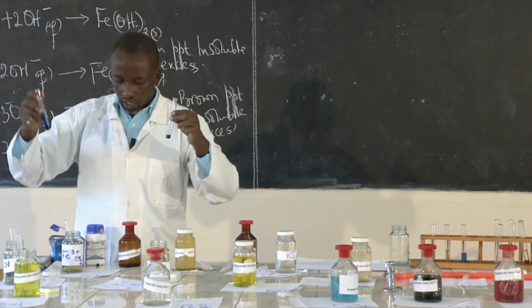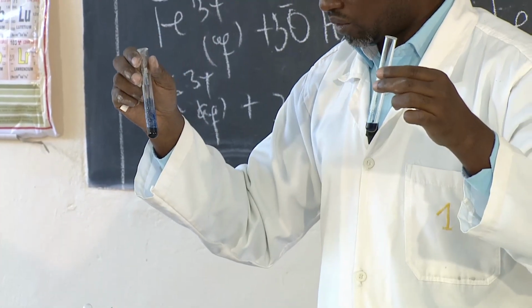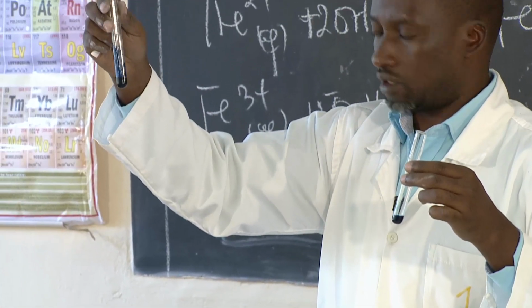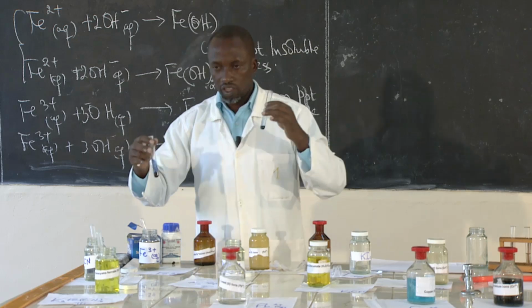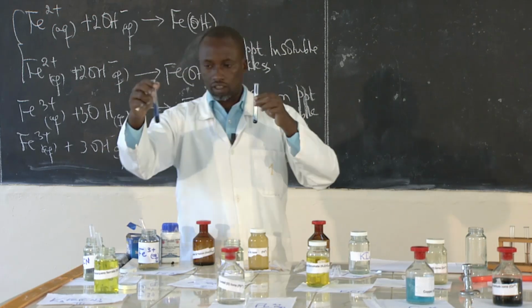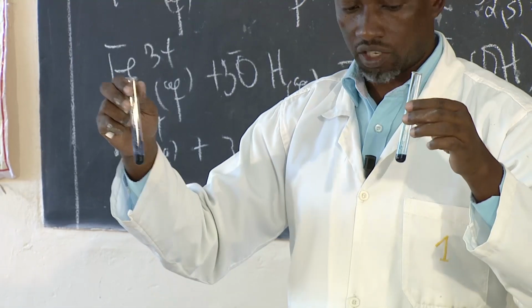This was iron 3 with hexacyanoferrate 2. This one here is iron 2 with hexacyanoferrate 3. They give the same results, the same observation.